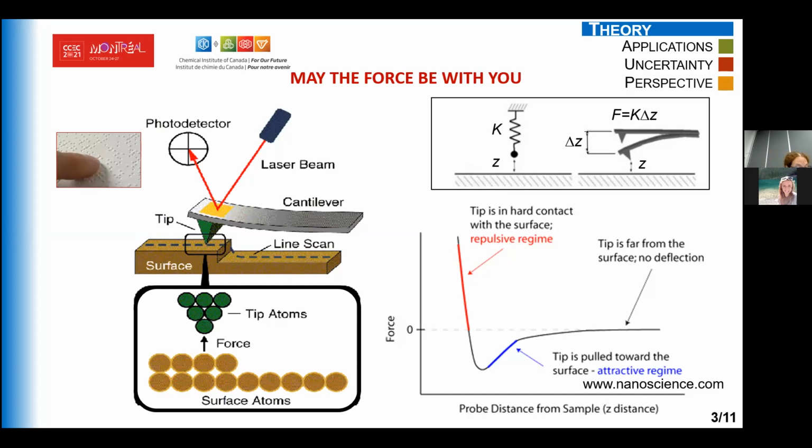Forces between the probe tip and the sample are sensed to keep the distance between the tip and sample constant as the probe is scanned over, let's say, low spots or elevated protrusions on the surface. As the tip moves up and down on the surface, the cantilever bends, and this deflection is tracked by reflecting a laser beam off of the back of the cantilever onto a position-sensitive photodetector.